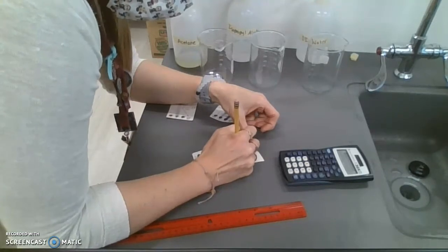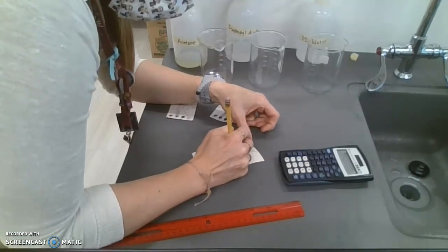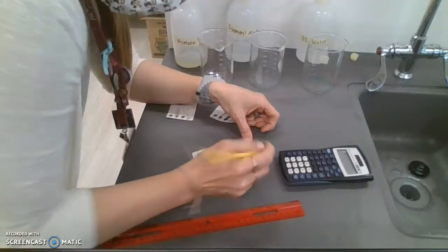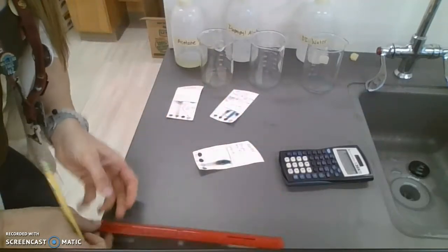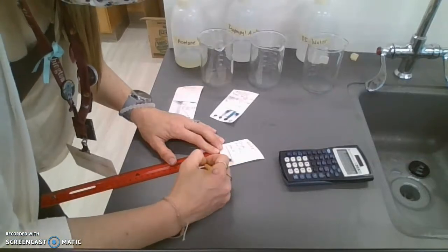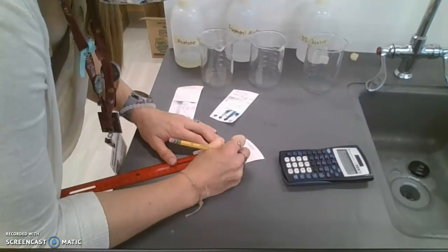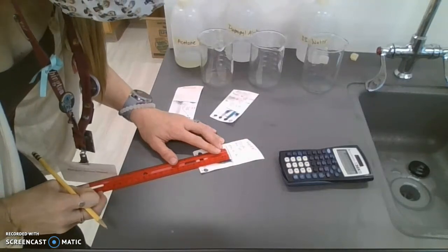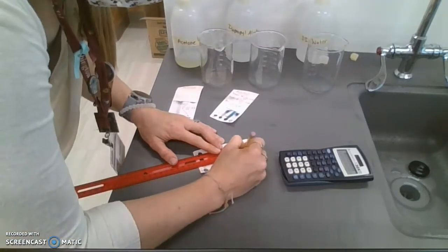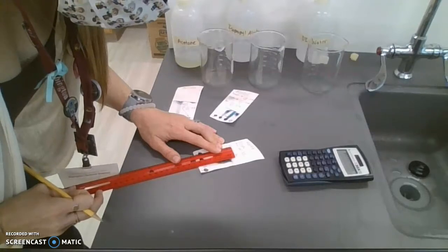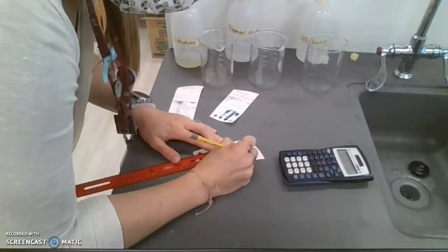So I have my blue and my yellow. The retention factor is how far that pigment moves over the solvent front. The yellow is 3.1 centimeters, the blue is 4.4 centimeters, and the solvent front moves 5.5 centimeters.